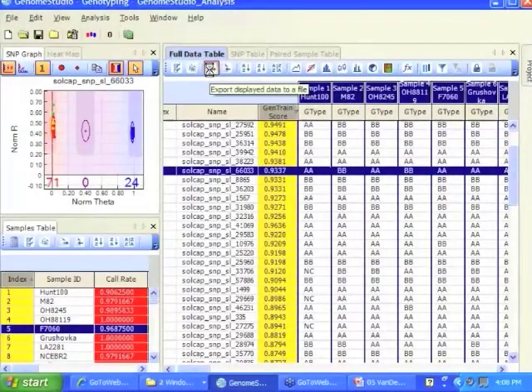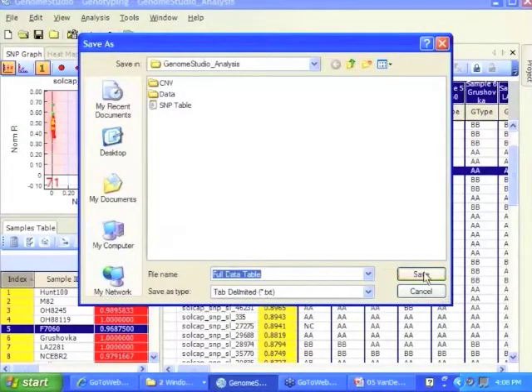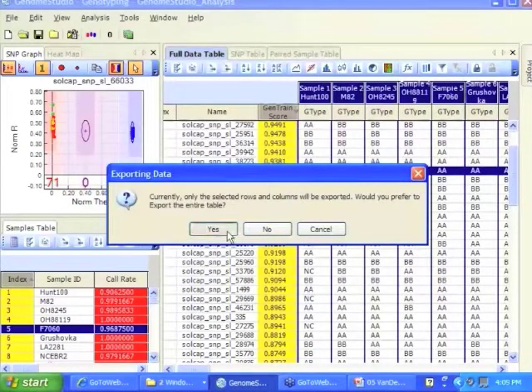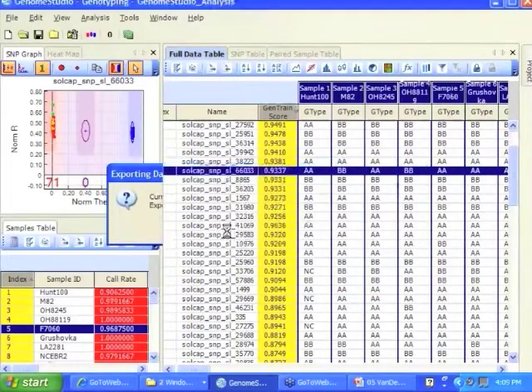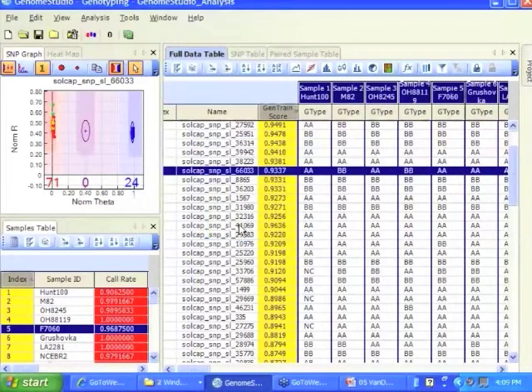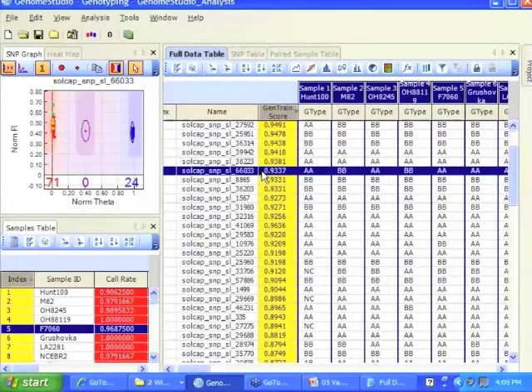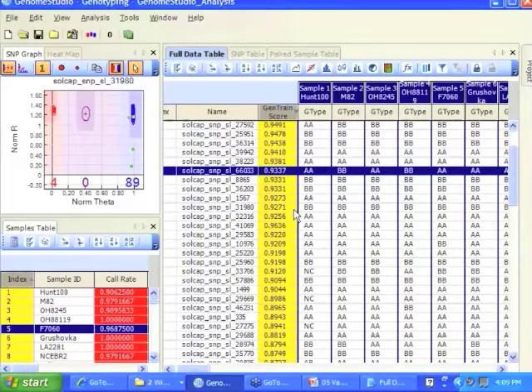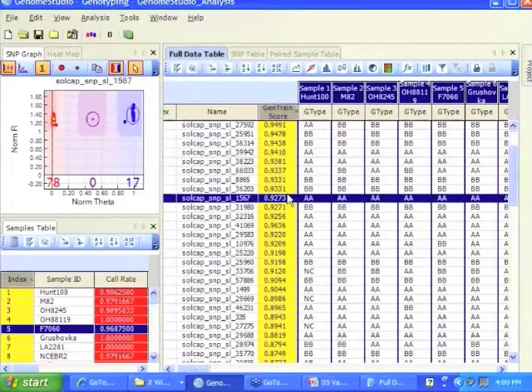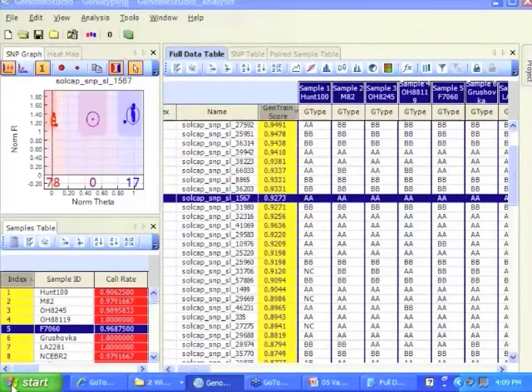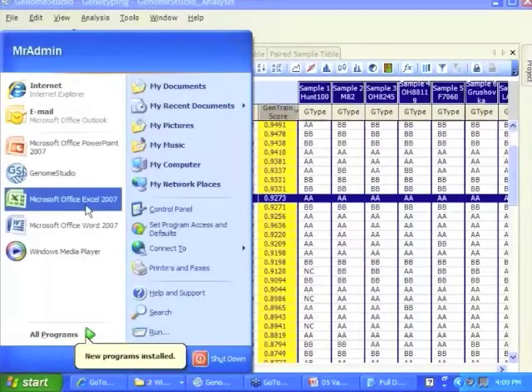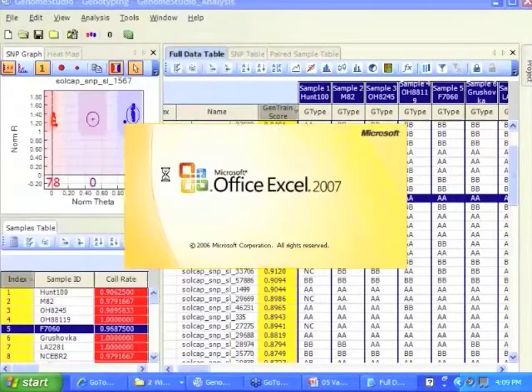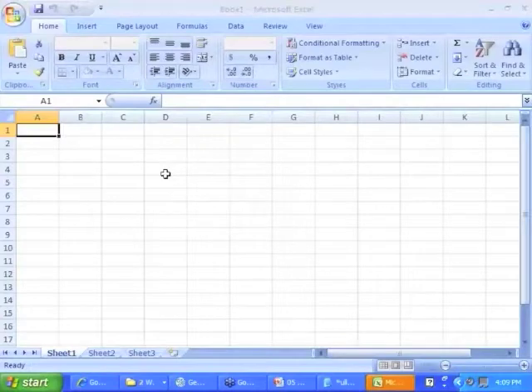So I'm going to export this. In this case, I'm just going to call it full data table, and do you want to hit the entire table? Yes. And I'll say yes to view the table, and it is coming, I think. I'll say yes. I'm a little weary about this computer, but I could actually find that table on this computer.